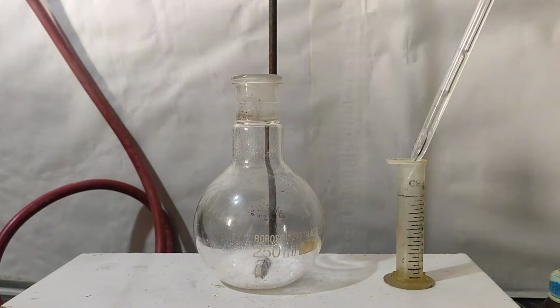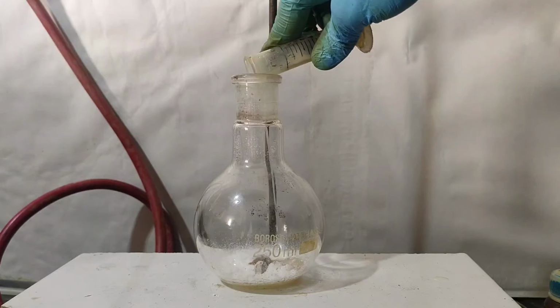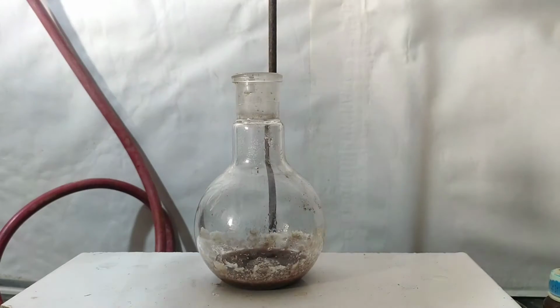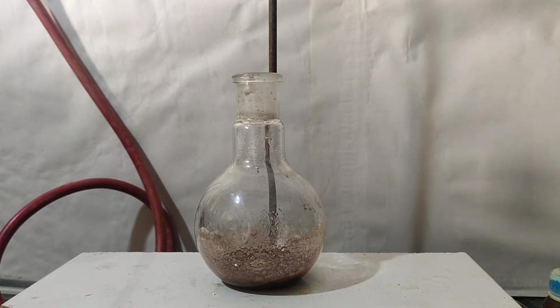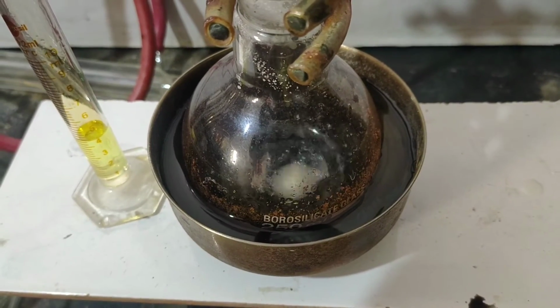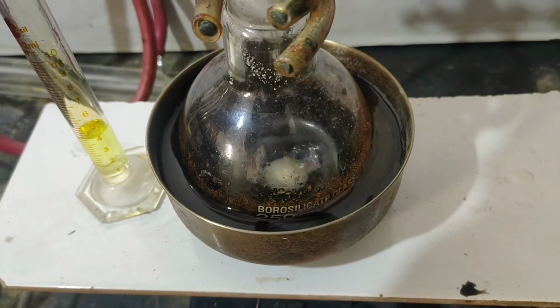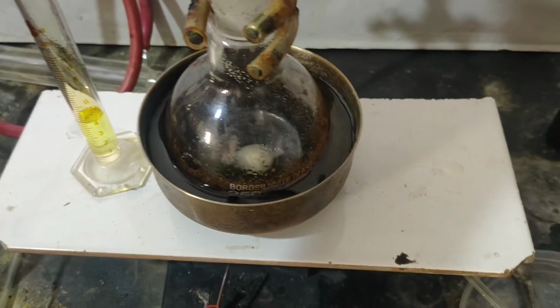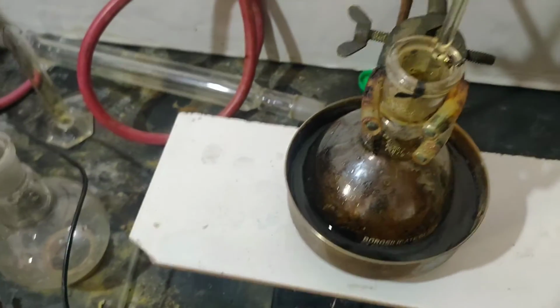I again tried making alpha-nitronaphthalene. This time I poured 5 grams of naphthalene powder in a flat bottom flask and added 10 ml of concentrated sulfuric acid and stirred. Now I placed it in a cold water bath and added 5 ml nitric acid dropwise, but this time a lot of tar was formed, so I discarded this reaction mixture.